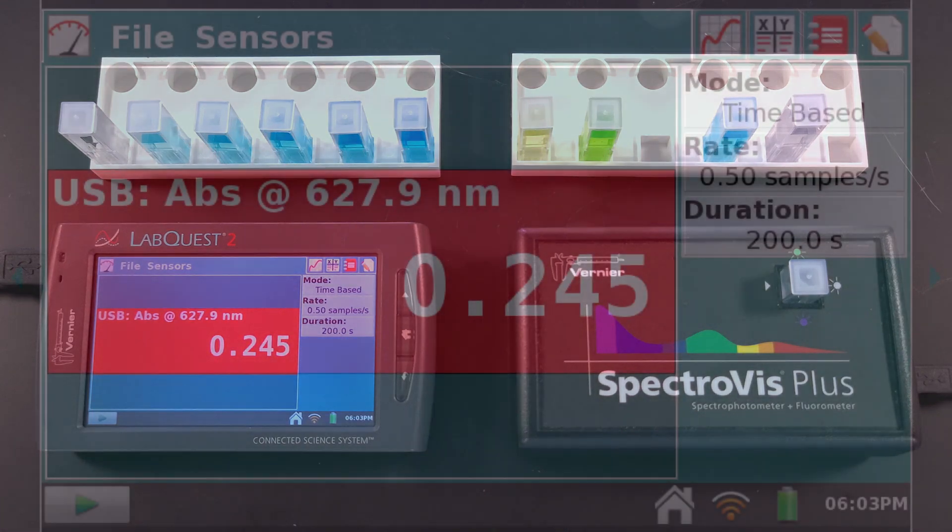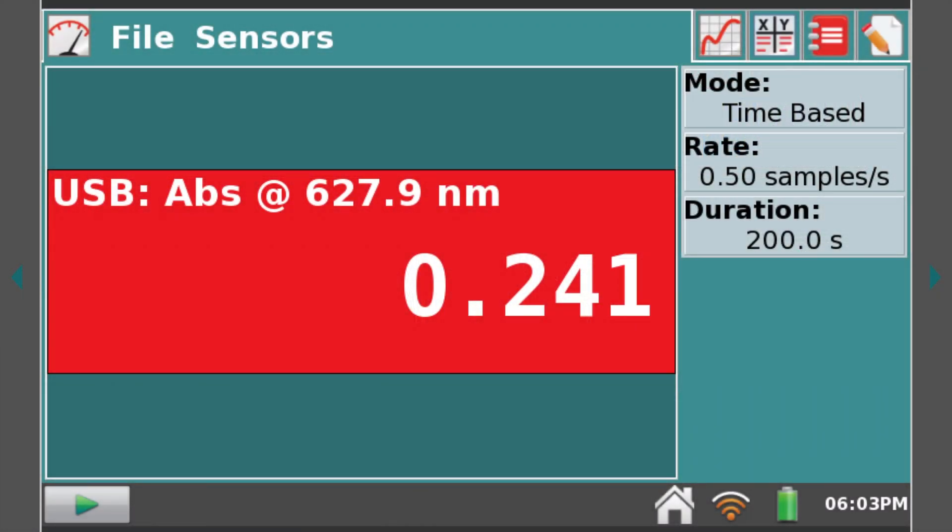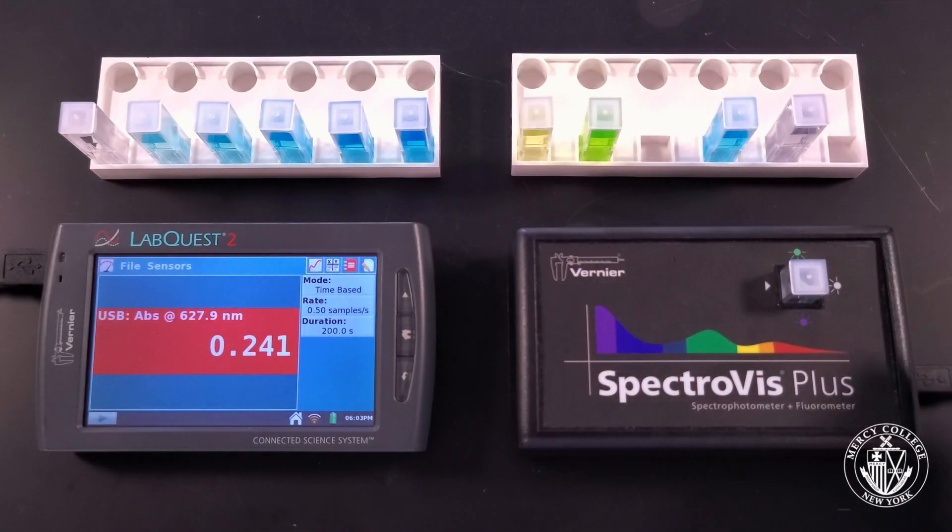Our third sample of frost arctic blitz appears to have an absorbance of 0.241.